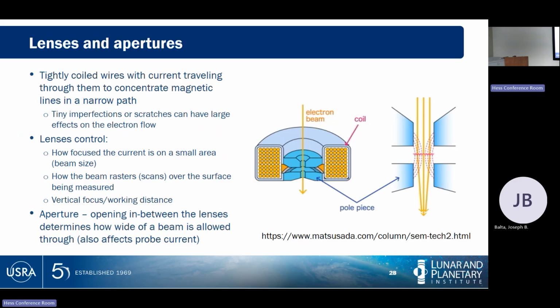And one other detail here. This spot right here we call the aperture. In our electron microscope, the aperture sets the current. Current is how many electrons are heading down to your sample per unit time. More current, more electrons are hitting your sample per unit time, and you're going to get a greater reaction for whatever it is you're doing. Close the aperture down, you limit your current. Open the aperture up, and you increase your current.